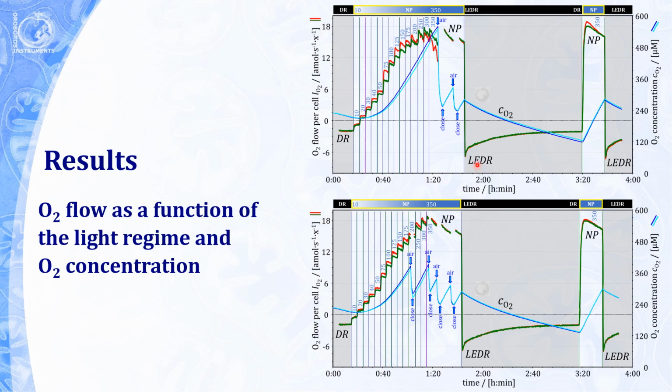The first trace shows the evolution of oxygen concentration while the O2K chambers remained closed. Oxygen concentration increased to hyperoxic levels due to photosynthetic activity. In the second trace, oxygen concentration was prevented from reaching severe hyperoxia inside of the O2K by intermittently opening the chambers.